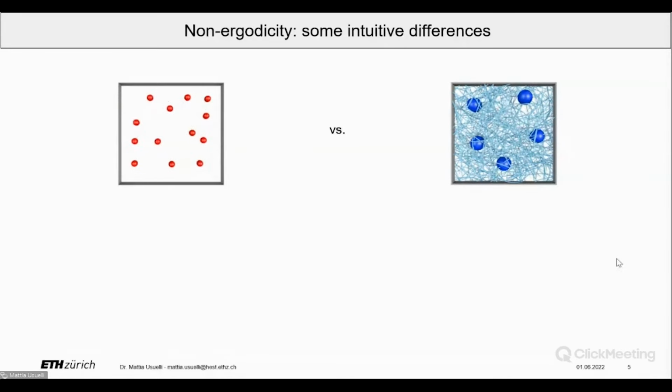So now we've been talking about Brownian suspensions. It means that if I put myself in the shoes of a particle inside the suspension, what is happening is that I'm simply kicked by different solvent molecules, and so I am performing a random walk. There is nothing preventing me as a particle from moving around. I can move freely. I'm simply kicked around by the solvent molecules. Actually, there are systems in which this is not true anymore. So let's have a look at this situation here.